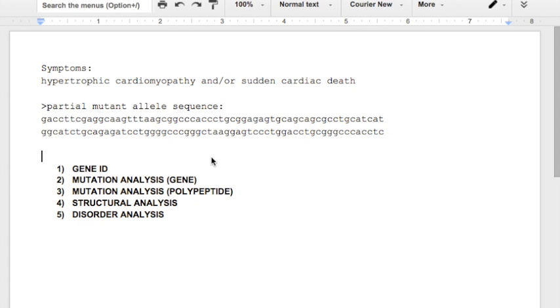Hi everybody, this is Mr. Gade, and in this series of screencasts, I'm going to walk you through a wide variety of web tools for DNA and protein sequence analysis, alignment, structural analysis, etc. This is all in the context of a genetic disease project.